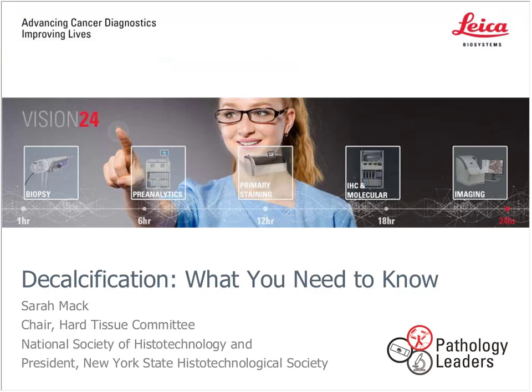So it's a real pleasure to bring you to our microphone. Sarah, welcome. Hi, Rick. Thank you very much for the introduction. Thank you all for attending. I'd like to get started today and talk to you about decalcification and what you need to know.